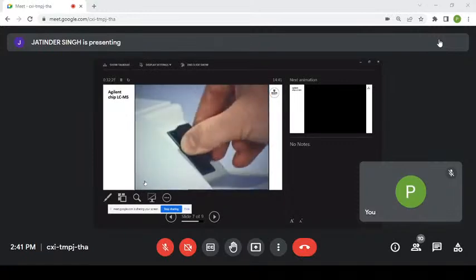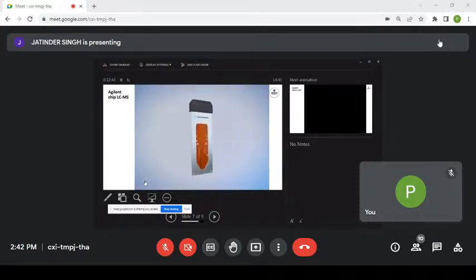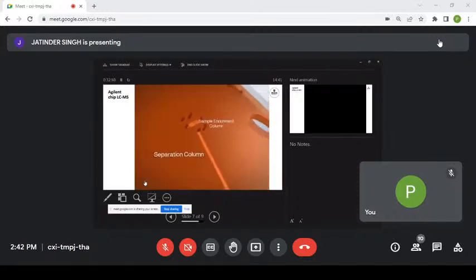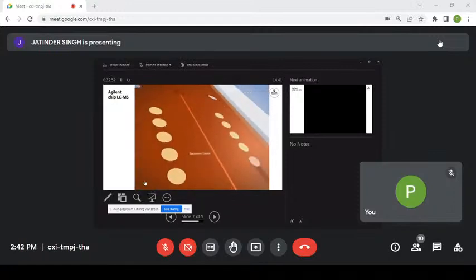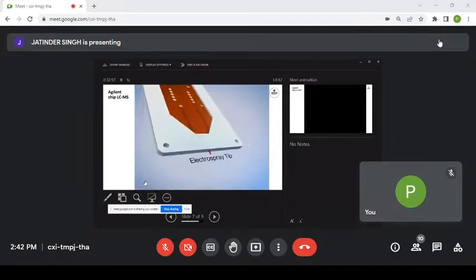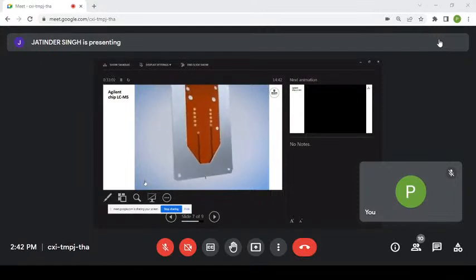And it's got a nice slot, pretty much like a USB port, where you can plug it in. It's got a little barcode on there so that the instrument can actually read which one it is, and they can keep track of which chip you used for what separations, which the pharmaceutical industry really likes. And now we go into the detail, where it gets more exciting, how the channels actually look. So that's the sample enrichment column, and there's the packed separation column. And then we go to the polyimide little spray tip that will just electrospray the analytes into the mass spec.